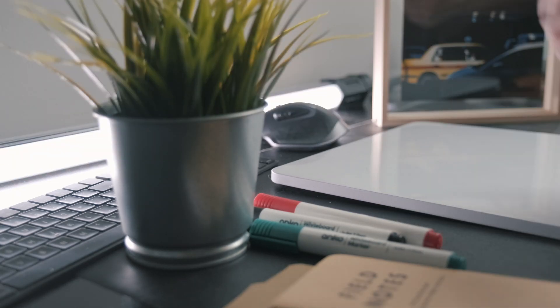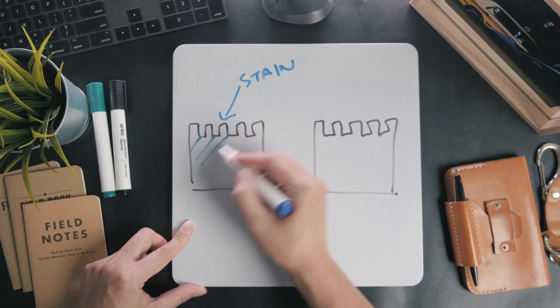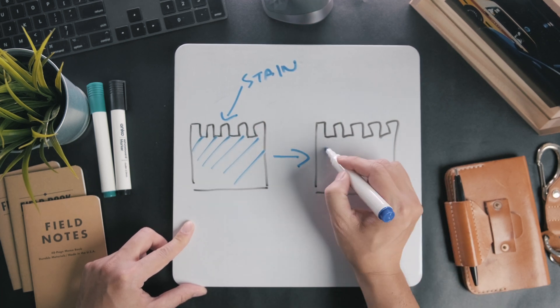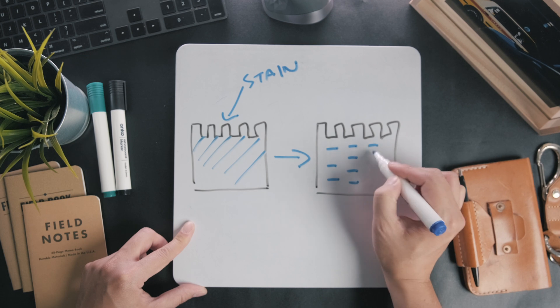There are a number of different staining or visualization methods and let's talk about the Coomassie stain, a blunt force technique if you will, staining all the proteins on the gel. This involves the addition of Coomassie Brilliant Blue or an equivalent dye directly on the gel to visualize the proteins. This is a quick and cheap technique that doesn't require much expertise.